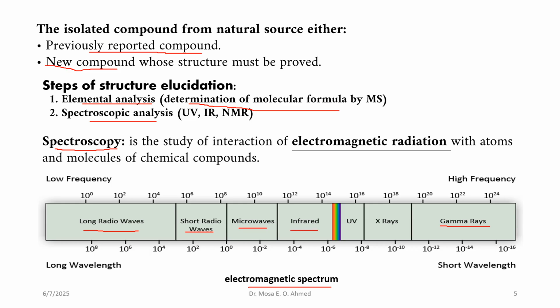Infrared applied in IR spectroscopy determines functional groups present in a compound. Also, the UV light used in UV visible spectroscopy will determine the presence of functional groups such as the pi bond and aromatic, mainly for compounds having these.